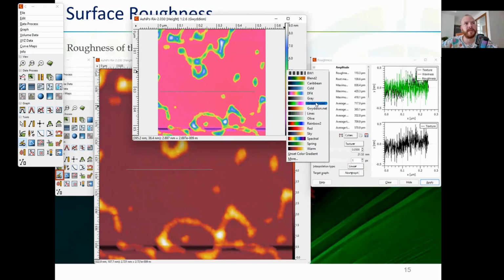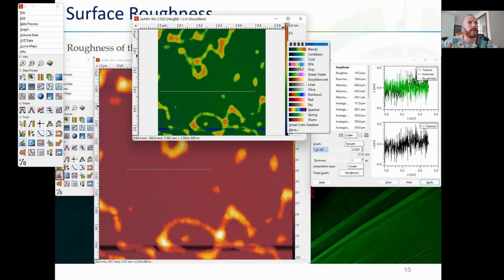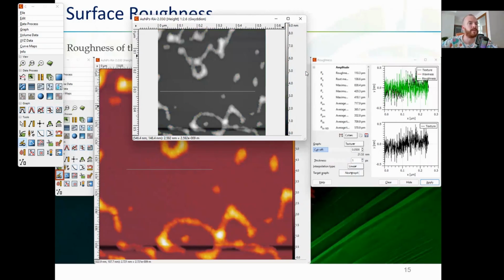This is, again, sometimes important. Or for example, like this, because visualization allows people to understand your picture better. Because I think this one, and you agree with me, is better than, for example, that one. This one is kind of like everything is gray, nothing. And here you understand that this red part is really higher than the green part.